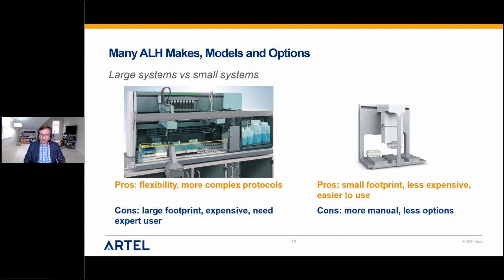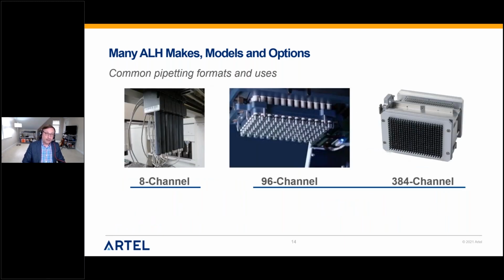And then if you think about the design of some of these, again, I would say stable. It's got a small footprint, but that doesn't mean you should have any less stable of a lab bench. I've seen many, many cases where people try to set these things up on the inappropriate bench, and then you've got shaking and moving all over the place, and it wreaks havoc on precision and accuracy for your assays.